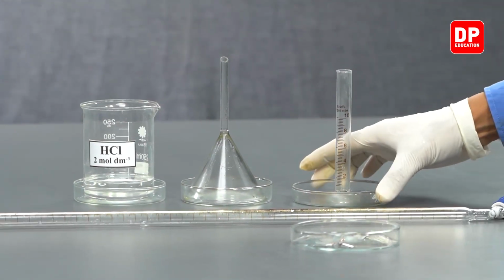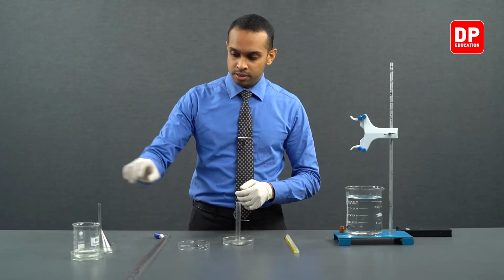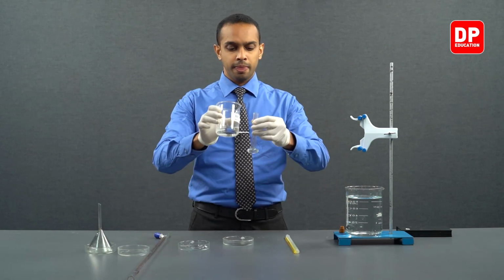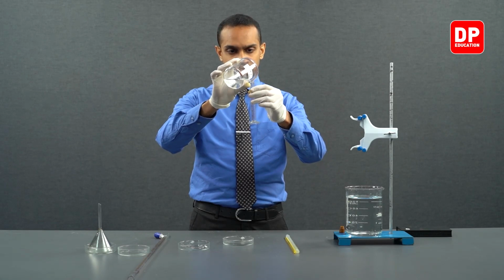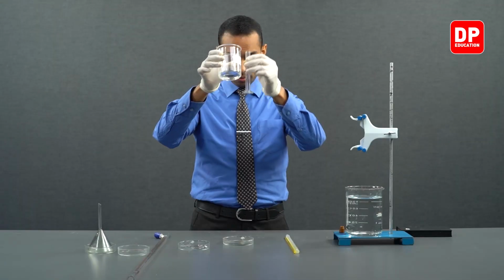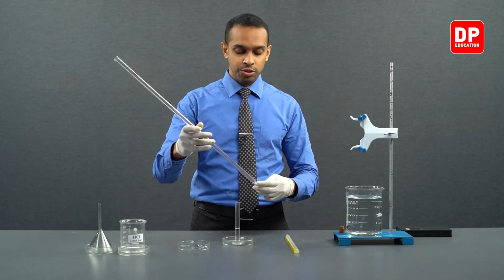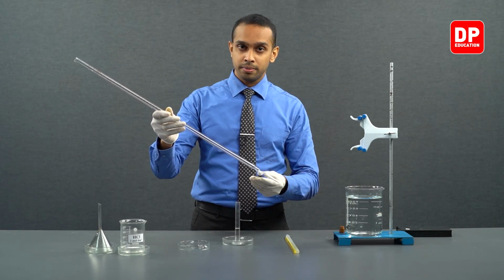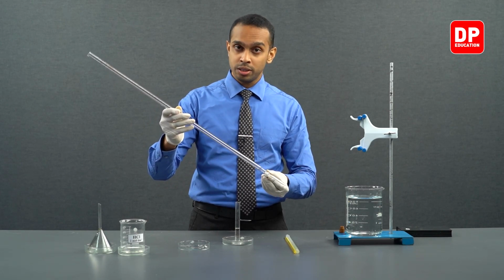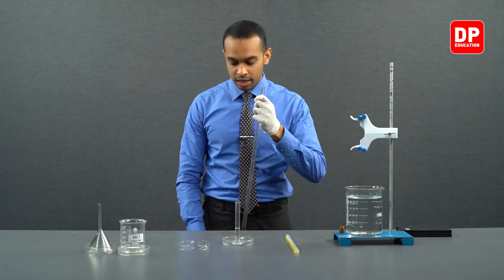Now, let's measure 5 milliliters of HCl. We have our measuring cylinder here. We'll take our HCl. We will measure 5 milliliters of HCl. And we are going to add this 5 milliliters of HCl into our burette. Before adding the HCl, we have to make sure that the burette tap is properly closed. After making sure that it is completely closed, we can move on to adding our HCl.